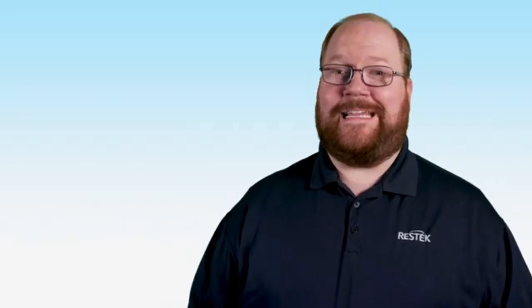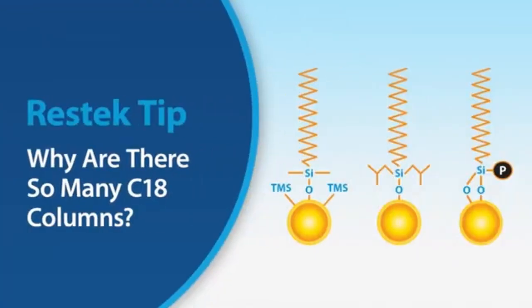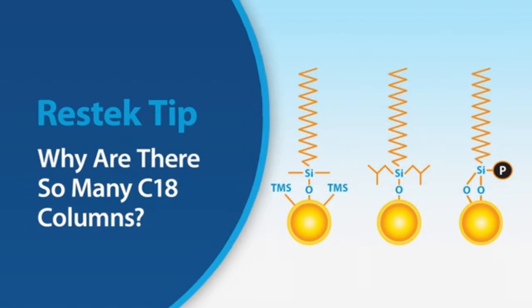Why are there so many C18 phases to choose from? C18 is a C18, right? Well, maybe. In today's Restek Tip, we're going to explore the world of C18 phases. Are there benefits to choosing one specific to your analysis, and what parameters should you keep in mind when selecting a phase? Let's start with the basics.